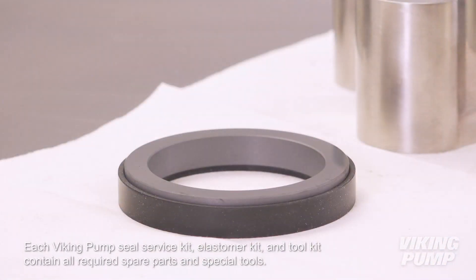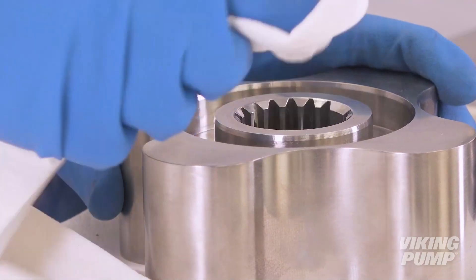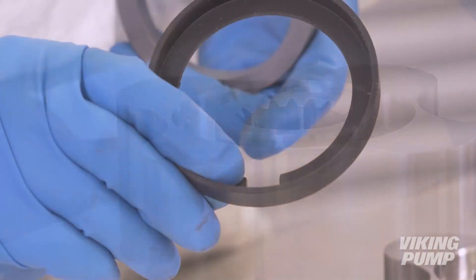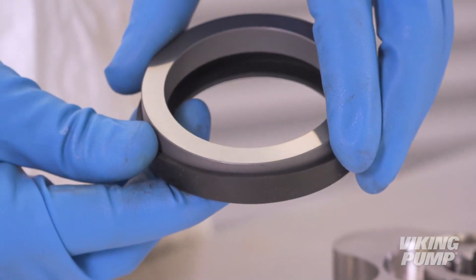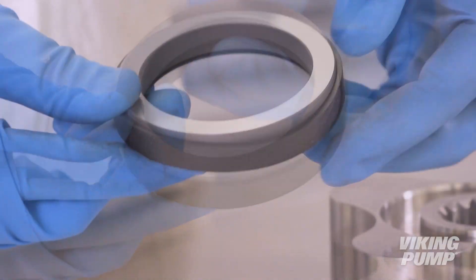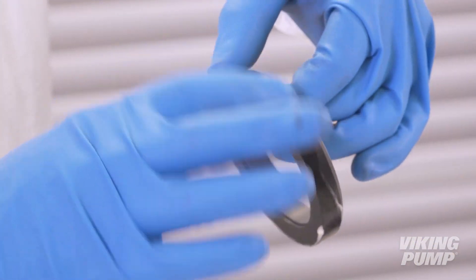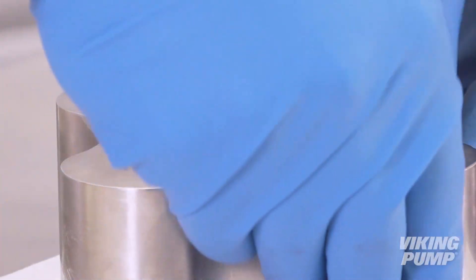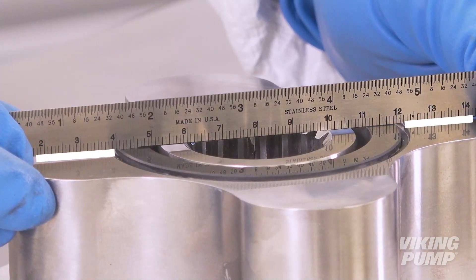Install new rotary seal faces and cups. To do this, place the rotor face down on a clean, non-marring work surface. Inspect the bore to make sure that it is clean and free from debris or damage. Line up the cutouts in the rubber cup and seal face. Lubricate the cup and press the seal face and cup into the rotor until it is fully seated. Make sure the face is level and parallel with the back of the rotor.